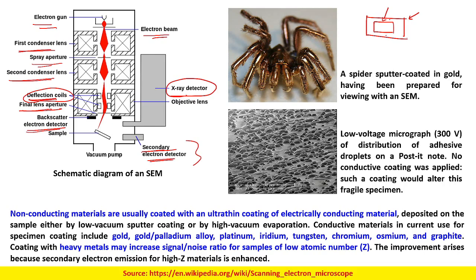No, it is not possible, because in this case you need to make the electron beam incident at a particular point. Then you move to the right and take the reading. In this way you will first scan the first line, then you come a bit downwards and scan the second line, then a third line, and you will have an array of pixels.